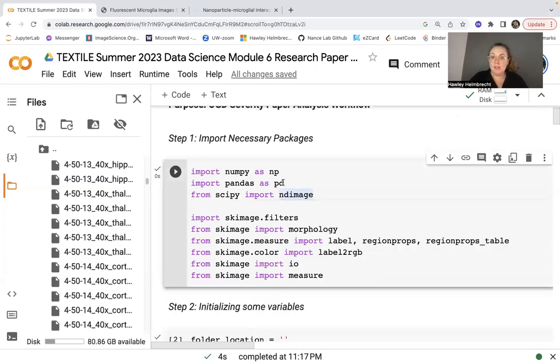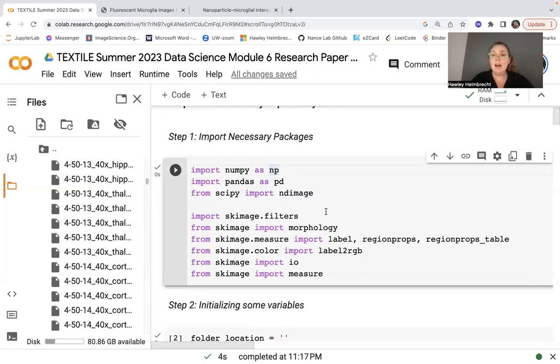So as always, the first step we do is we import our necessary packages. None of these should be unfamiliar to you all, as we're doing the same process as before. We're just doing it to hundreds of images this time. I would even say that this experiment, one of my first experiments, is small on the number of images needed side. This process is still definitely runnable on my personal MacBook Pro. I don't need cloud computing for this, which is really nice as far as accessibility goes.